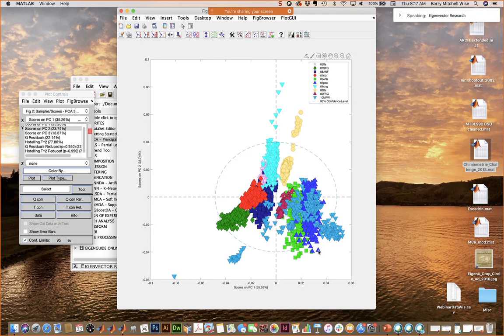That allows you to see how the groups really lie, because you do have this problem where when the classes are put down, they're put down in groups of everything of one class, and they wind up being one on top of the other. That makes it hard to see. One of the things you can do is change the size of the class symbols and make them smaller. That helps sometimes. But sometimes it's easiest to just send things to the back. And that lets you really see the structure in the groups on top.